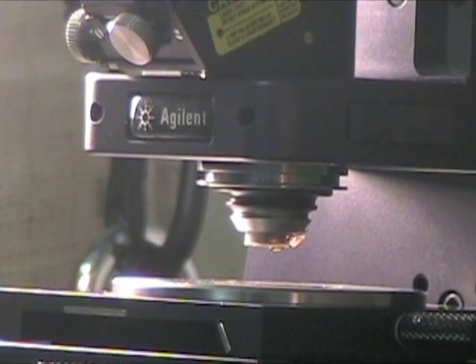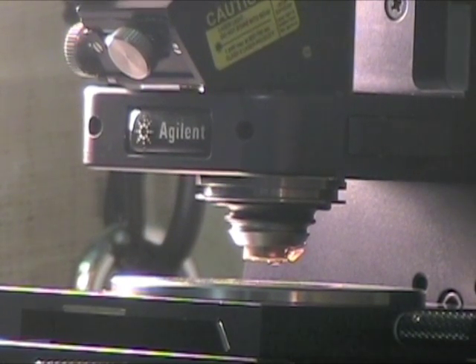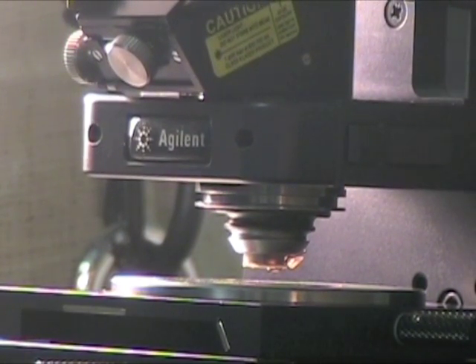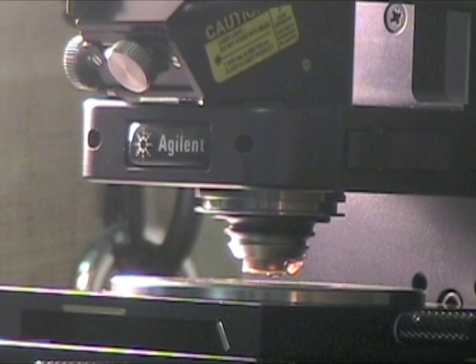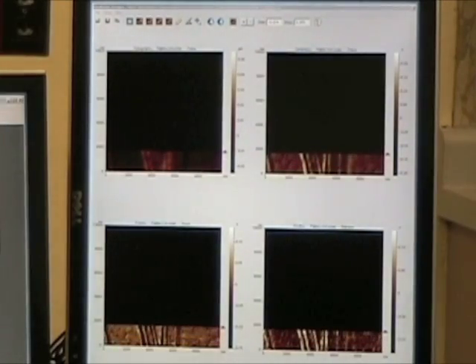The scanning process is started, and the movement of the cantilever deflects the laser beam as it traces, line by line, over the surface of the sample. This movement is seen by the photodetector, and data is recorded. Notice the line-by-line imaging on the display.